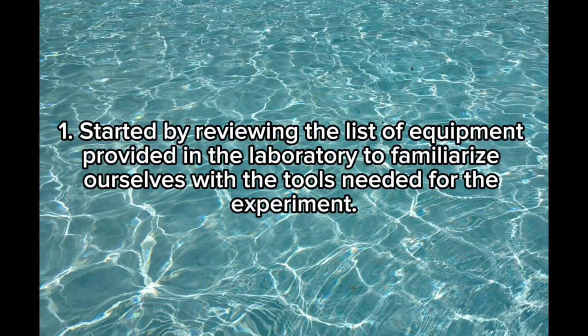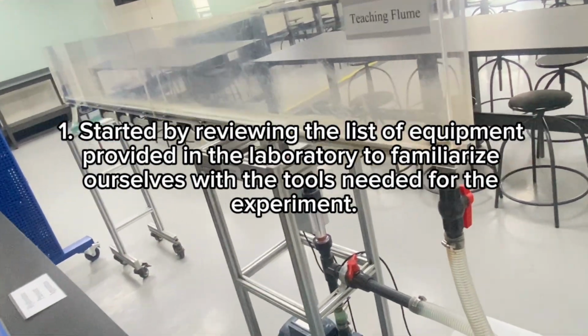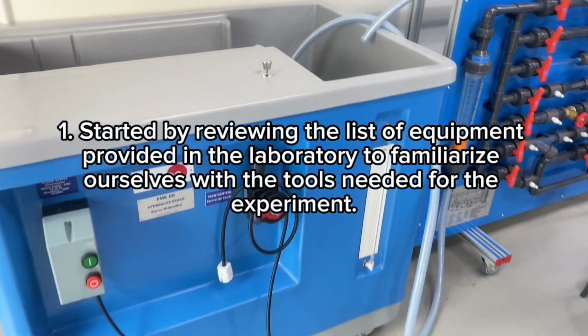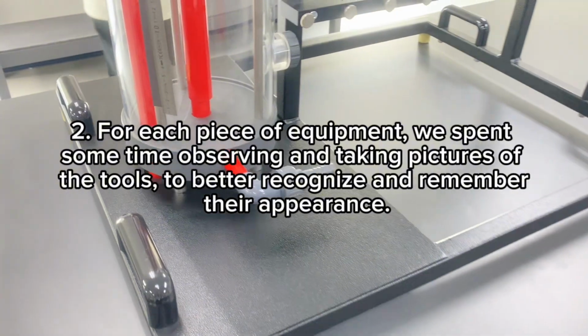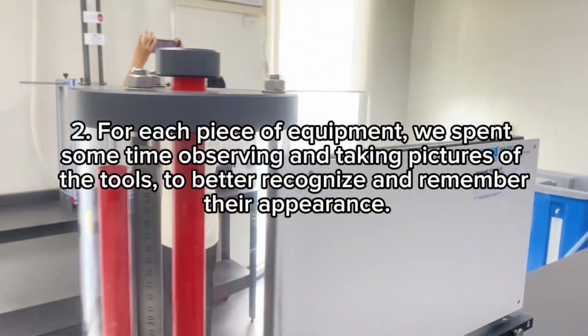Procedure 1. We started by reviewing the list of equipment provided in the laboratory to familiarize ourselves with the tools needed for the experiment. Step 2. Each piece of equipment, we spent some time observing and taking pictures of the tools to better recognize and remember their appearance.